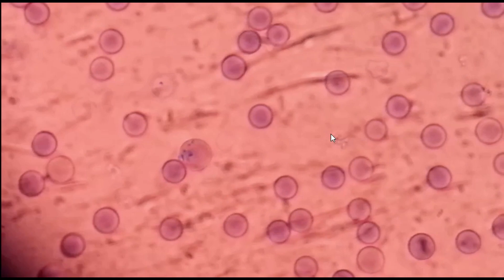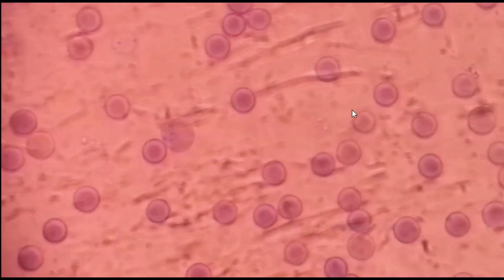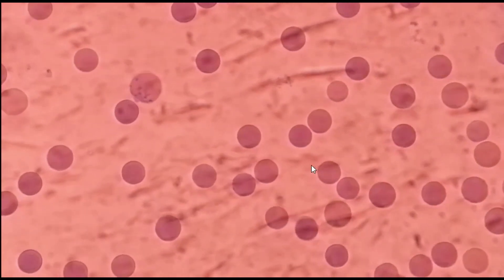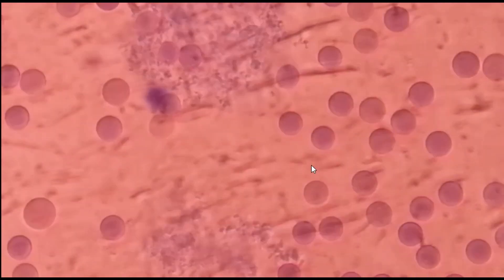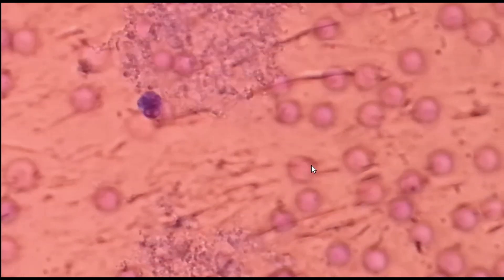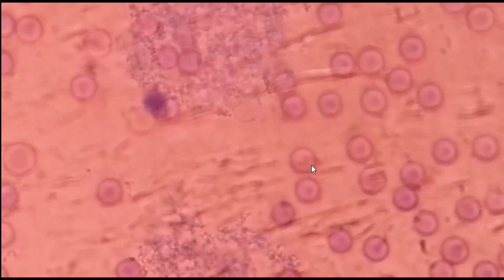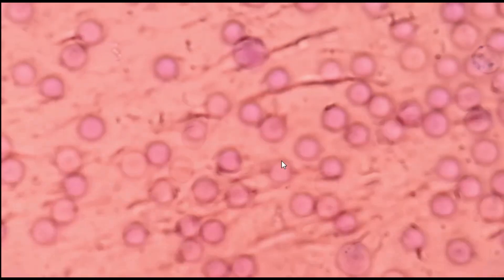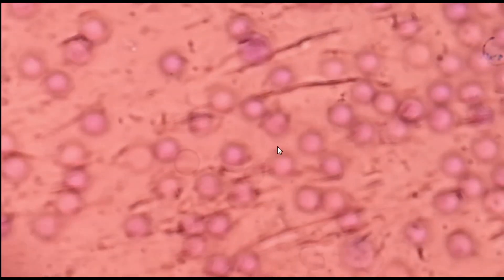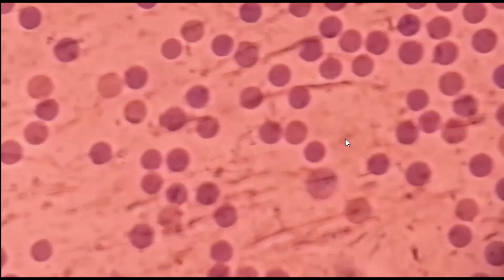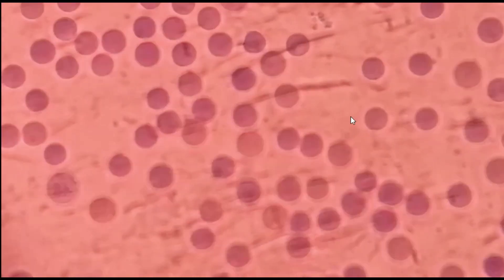Here you can see these are all red blood cells. We can see the three-dimensional, 3D form of red blood cells — a ball-like appearance. These are all red blood cells, in brief RBCs.